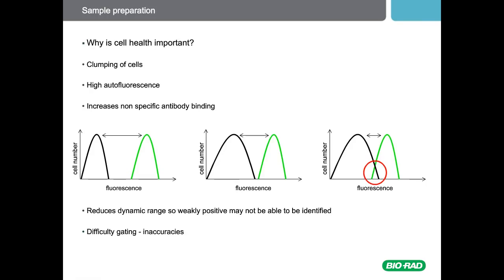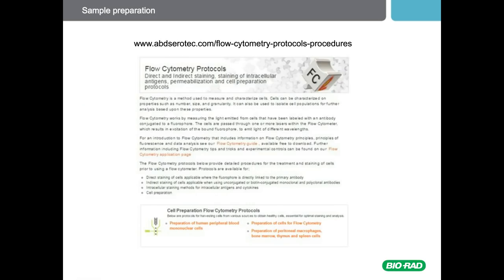If you're interested in more detailed step-by-step protocols for cell preparation for flow cytometry, then we have protocols on the website, also in PDF form which you can download. Just go to the Application Resources section of the ABD website, and there you'll find protocols for flow cytometry.